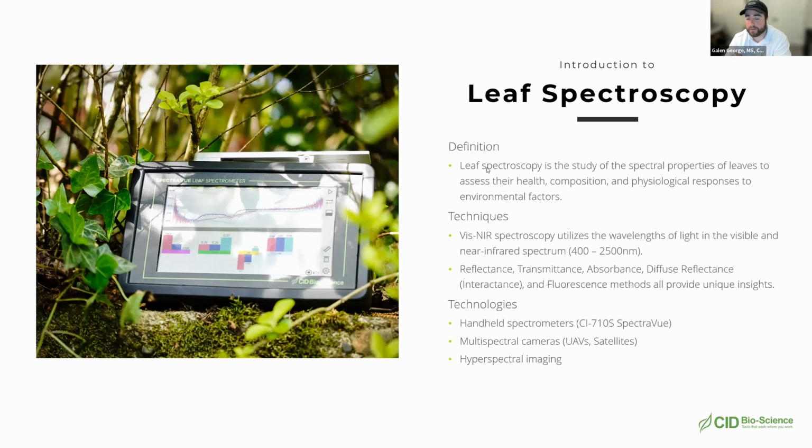Temperature, humidity, I think I've already covered this, but operating temperatures, the specifications are on the website or earlier in this slideshow. And humidity, as long as it's non-condensing, should not pose an issue. If you have condensing humidity, and it's causing moisture to build up on that optical window, then you're going to have problems and you're not going to be able to use the device.